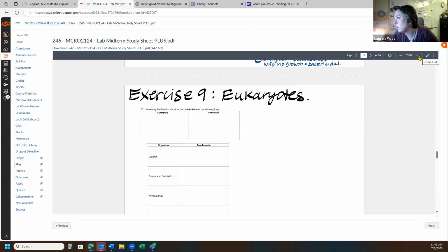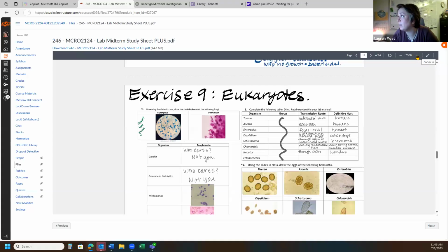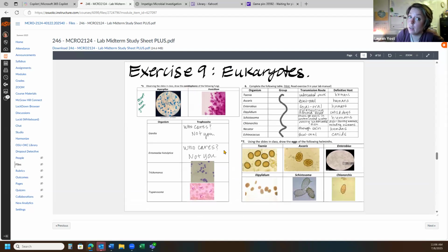You can see, of course, when you're looking at it in the microscope, that the Aspergillus had those round dandelion shapes, and the Penicillium had this sort of flat look, like paintbrushes to me. What are these structures called? It says it here. Conidiophores.